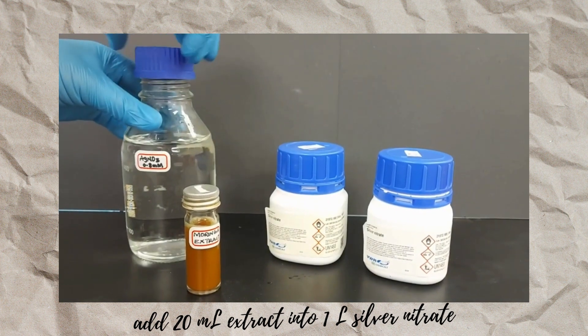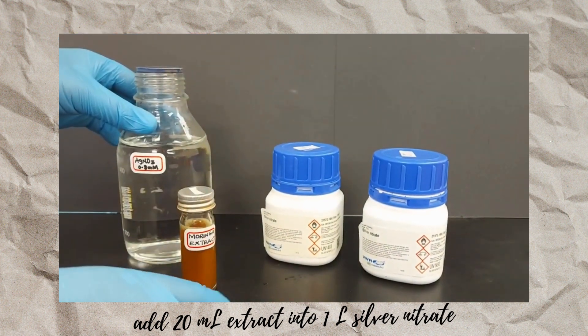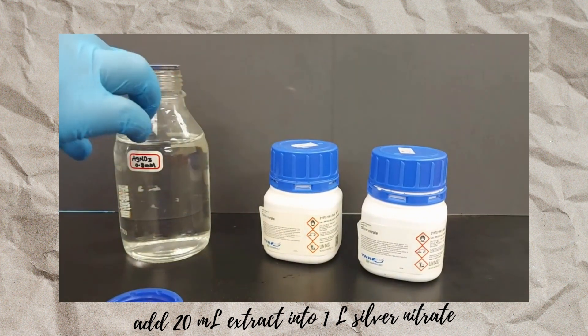Now slowly add 20 milliliter of the 20% plant extract into one liter of the prepared silver nitrate solution.